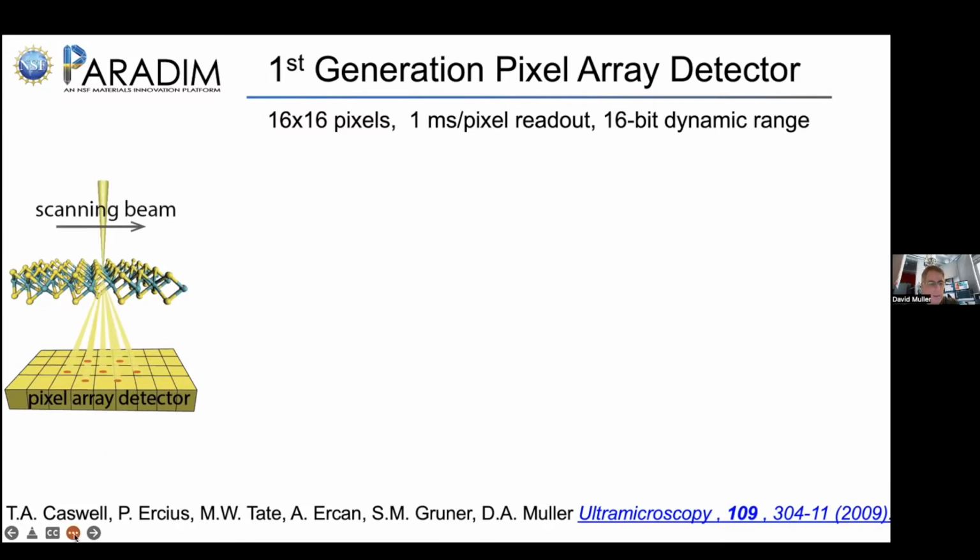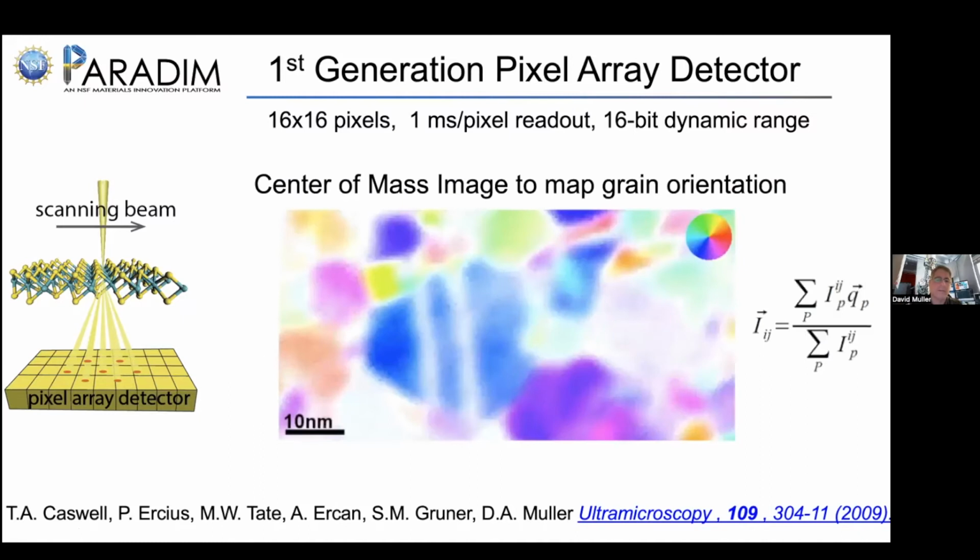And so Tom Caswell, the undergrad who was working on the project, took it over to our synchrotron beamline, put it on the beamline, pulled out all the stops, all the apertures, gave it a full blast of the X-ray beam, figured out the dose, did it for 2 hours, and saw no damage. But when we did the numbers of what that would correspond to on the electron microscope, it was about under a second of illumination. And that sort of reflects the difference in the number of particles that you might be looking at between the two systems.